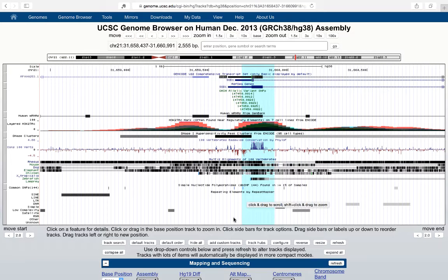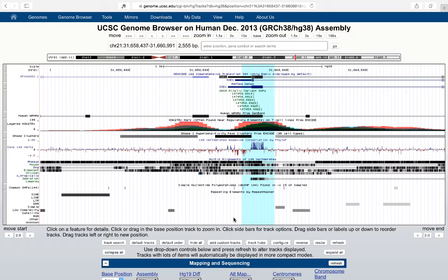Here you can see several SNPs from the dbSNP track, some of which are black and some of which are blue. The two that are blue means that there are SNPs occurring in a 5' or 3' untranslated region. Black SNPs are intronic or intergenic. Green are coding SNPs but they are synonymous. And red are coding but non-synonymous or splice site variants.